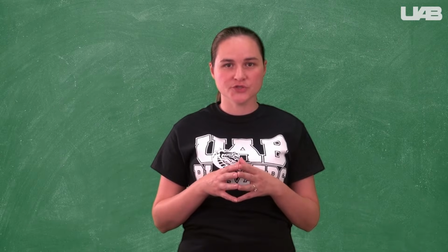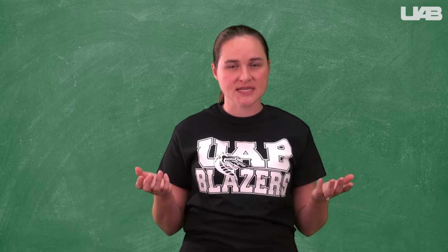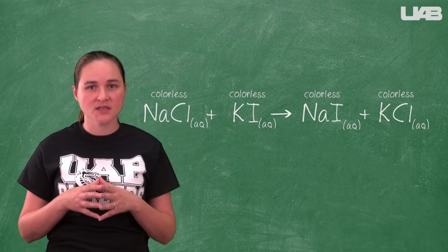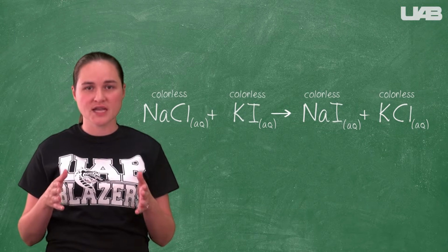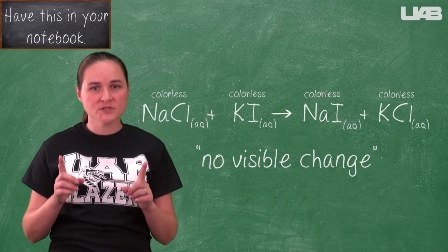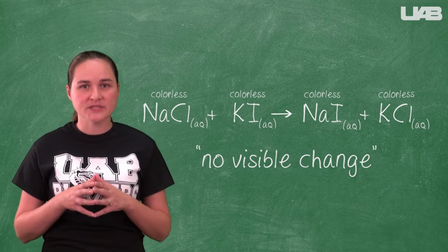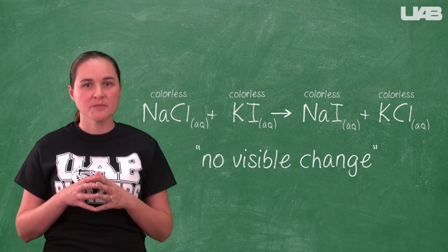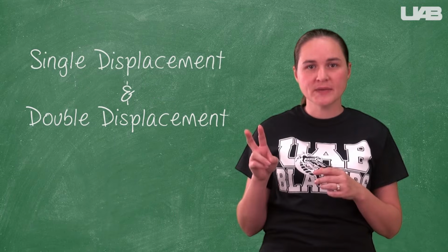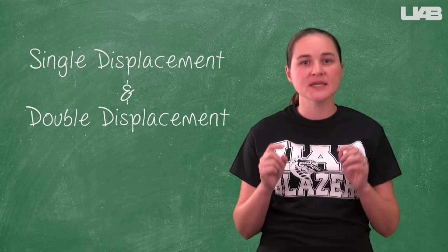When you mix two solutions and you don't notice any changes, it's pretty easy to assume that no reaction has taken place. However, a number of reactions make products that are clear, colorless solutions which are soluble in our reaction mixture. Because of this, chemists use the term no visible change rather than no reaction. This implies that we didn't make any notable observations, but that we aren't willing to commit to the fact that nothing happened.